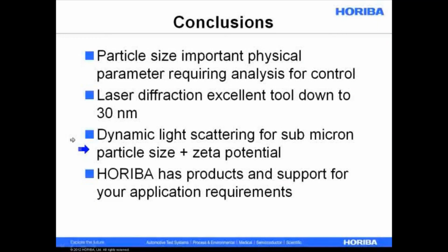And now we can do that work both for particle size and help you perhaps with the dispersion. Maybe you want to do an isoelectric point test of how zeta potential changes as a function of pH. We have a webinar on doing those kinds of tests as well. And that could be used, for instance, for a formulator, looking at the best ways to create formulations of new pigments used in paints or in other applications.